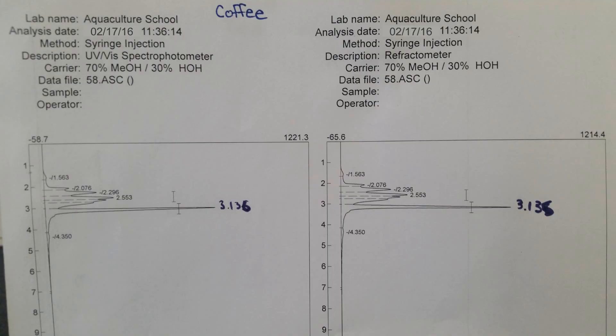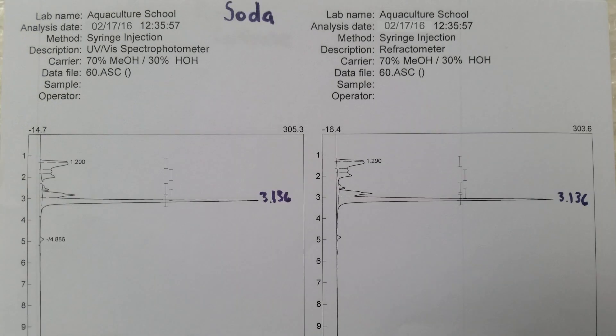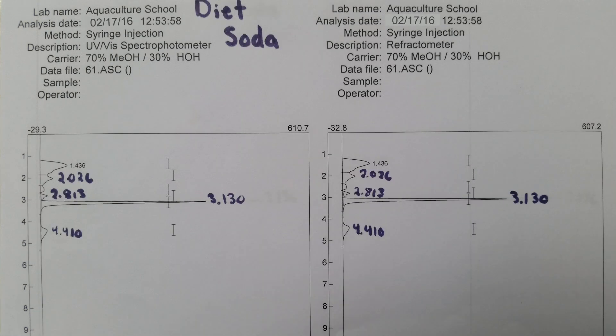In the coffee, we found there was a peak at 3.13. In the tea, the peak occurred at 3.13 again. In the soda, the peak occurred at 3.13. And then finally, the diet soda had a peak of 3.130, so same as all of them.